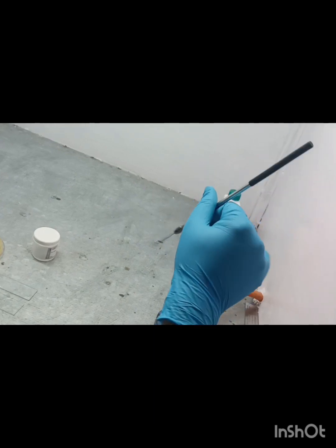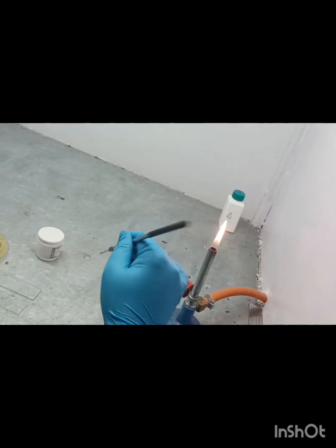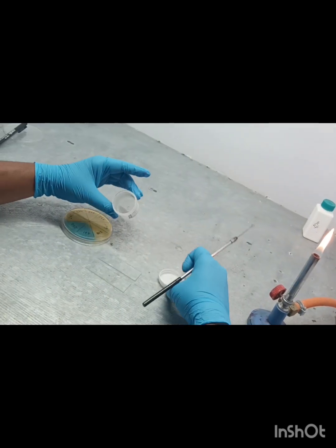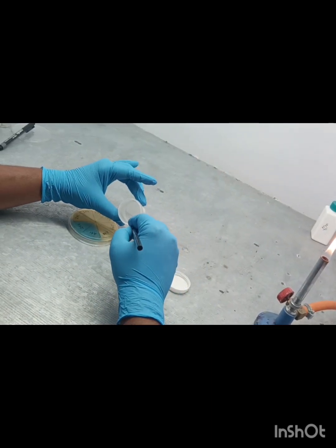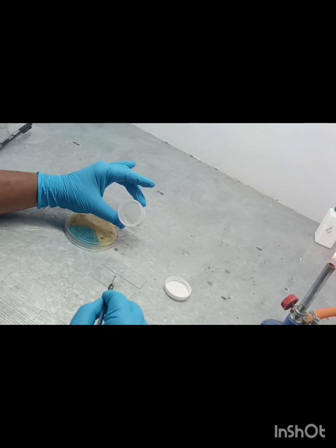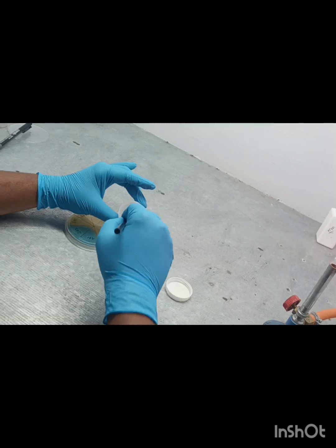Then allow it to cool. Then take a loop of distilled water.